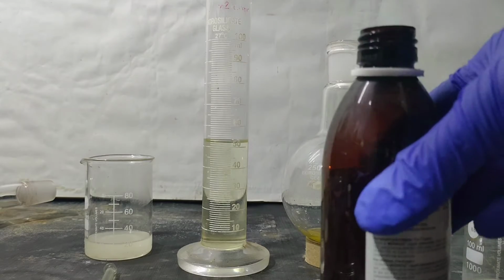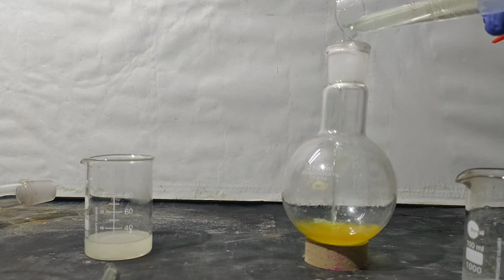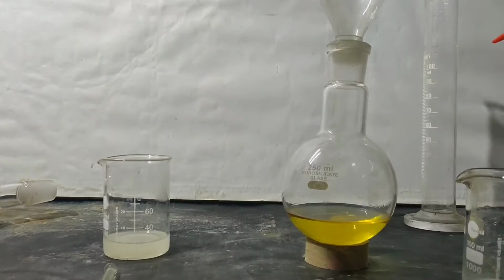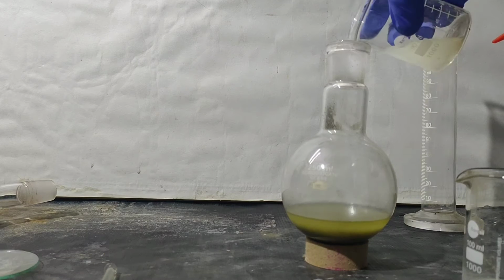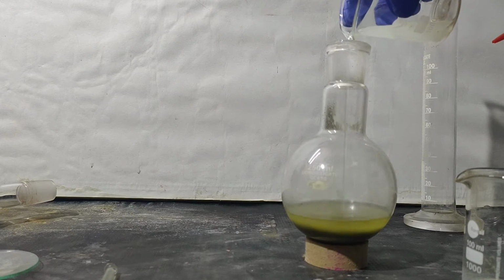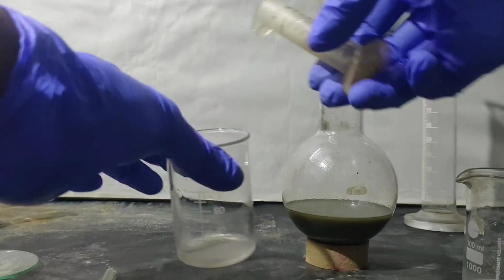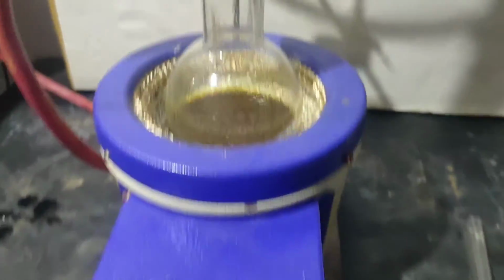Then I measured out 50 ml of methanol and washed the nitrobenzene stuck in the tube. With the help of a powder funnel, I added 10 gram of zinc powder and then transferred the sodium hydroxide solution. Then I washed the beaker with 10 ml methanol and set it on reflux for 12 hours.